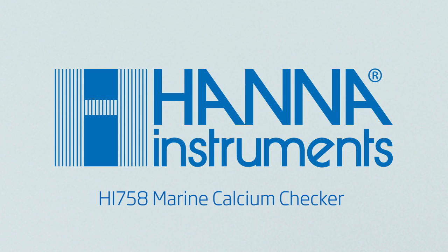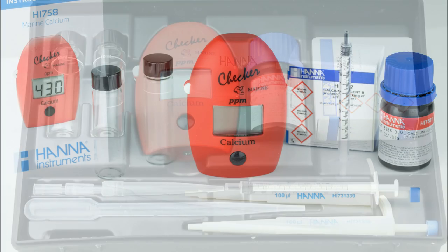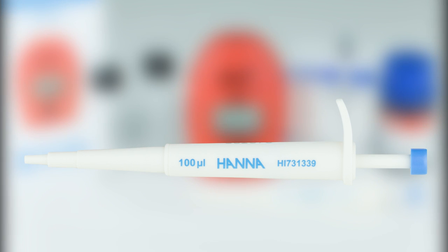The Hanna Instruments HI-758 Marine Calcium Checker is a compact and portable photometer that combines the accuracy of professional photometers with the convenience of chemical test kits. The one-button design allows users to operate the meter with ease. Today we'll go over the proper use of the HI-758. The HI-758 has been redesigned to include a 0.1 mil pipette, which allows for greater accuracy.